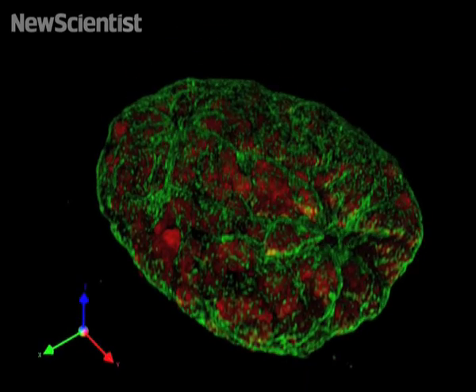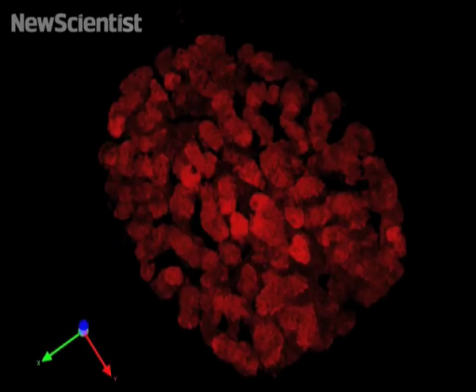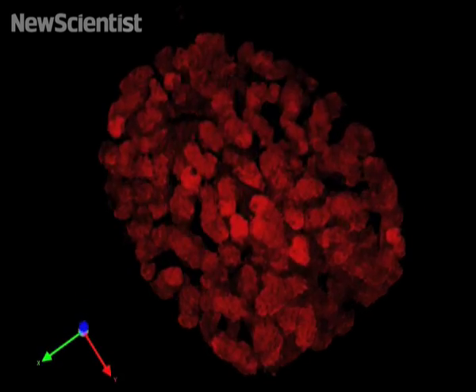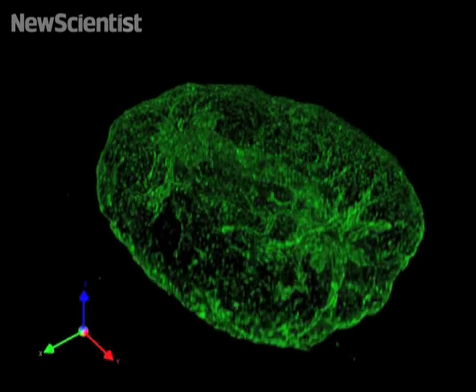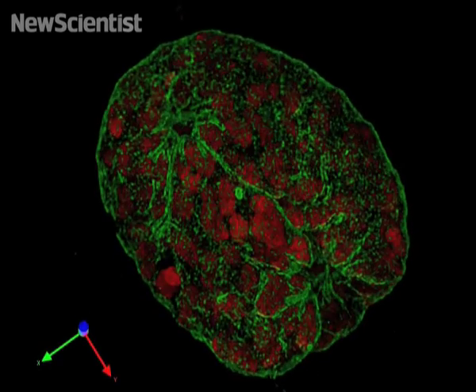Researchers created high resolution views of fixed mouse cells that have been stained with three different fluorescent colors to label the DNA, the nuclear envelope, and the pores through which molecules are transported into and out of the nucleus.